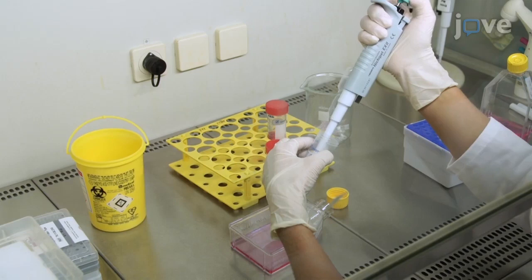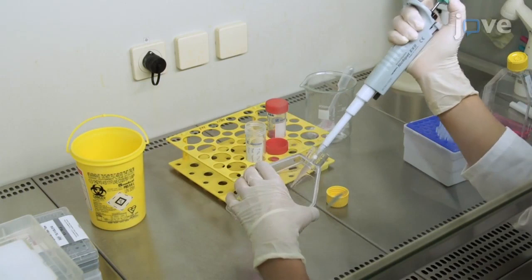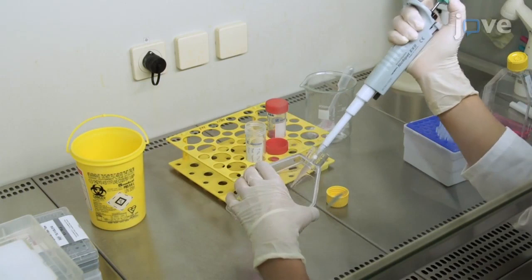Add 1 mL of cells to each of two T75 flasks containing 20 mL of RPMI medium for a 16 to 24 hour incubation at 37 degrees Celsius and 5% CO2.